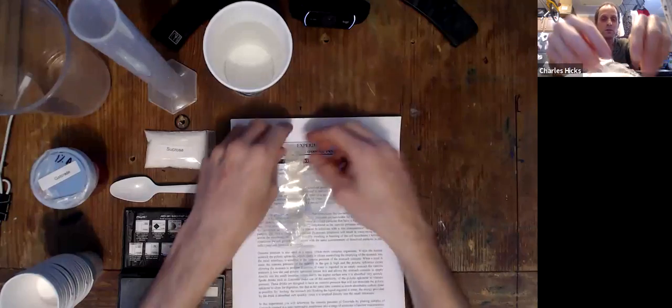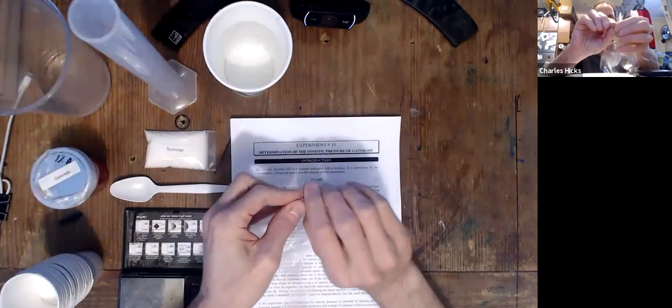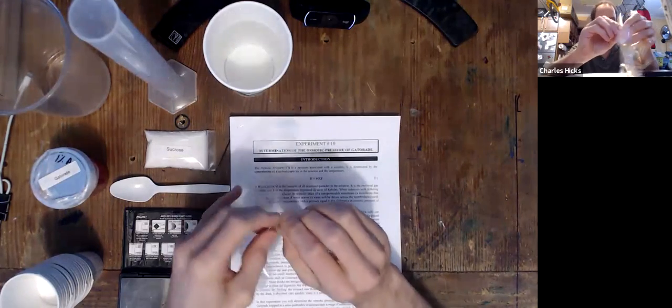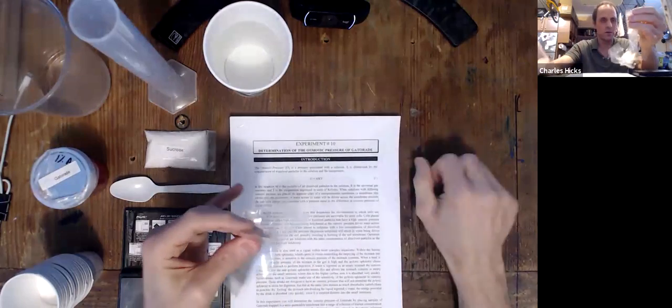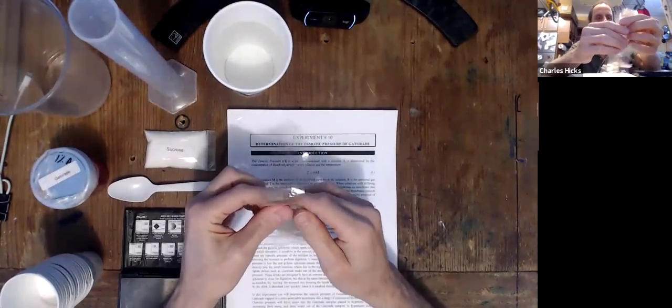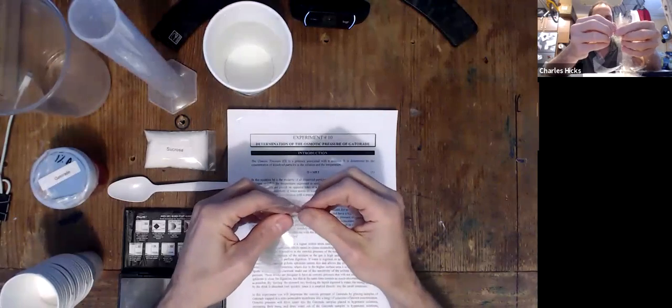Now the first thing we have to do is undo the staple on the dialysis tubing so that we can get these apart. And these pieces of tubing have to be incubated in water for a while in order for us to be able to open them up.